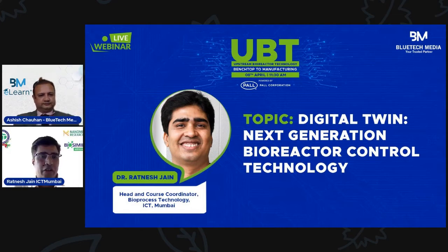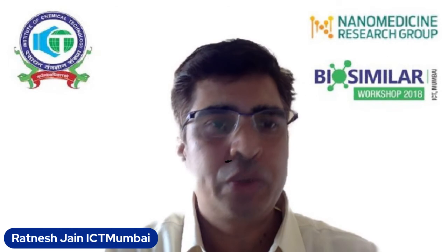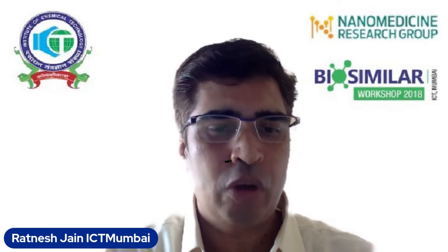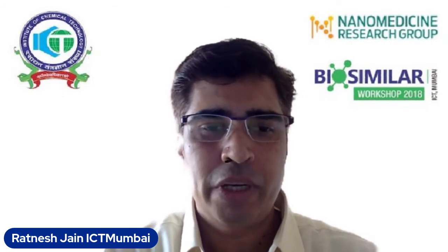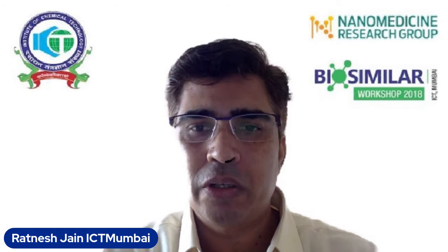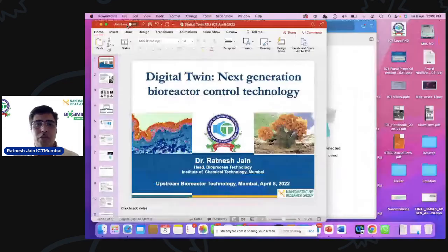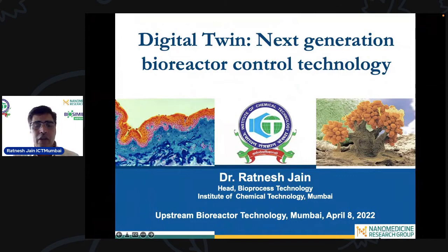Thank you, Ashish, for the nice introduction. I also thank Blue Tech Media and Pall Corporation for arranging this webinar. In a few minutes, I'll be sharing my screen and we'll be talking on this subject, which is very essential in the coming days, which we call Biopharma 4.0, or in a simple understanding, Industry 4.0. Biopharma 4.0 or Industry 4.0, where digital twin is a very important part, is a next generation bioreactor control technology.